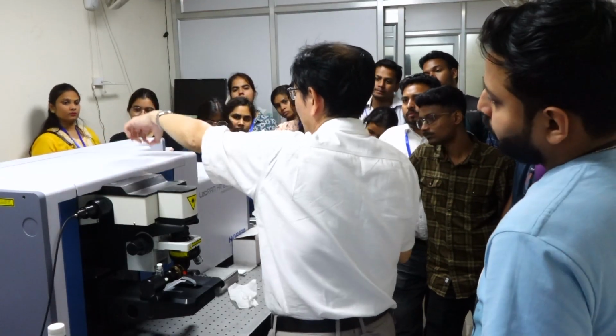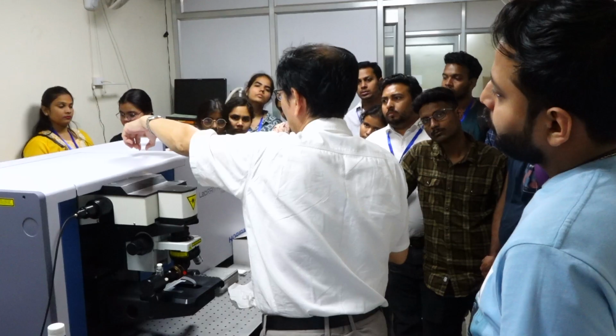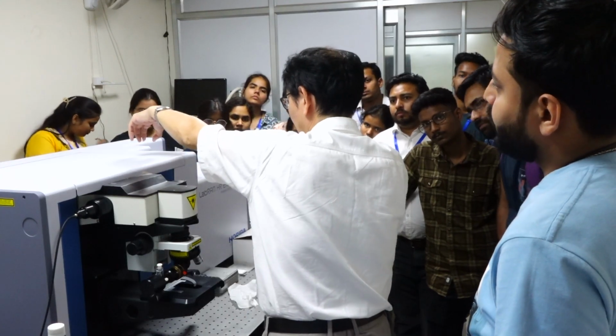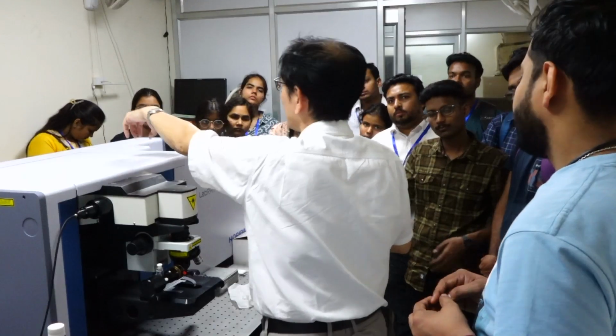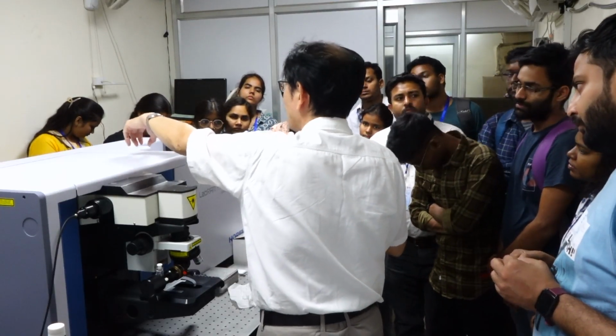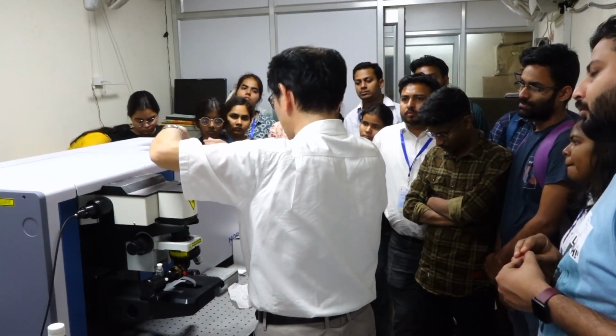I guess one more filter should be here, a notch filter, to remove the excitation wavelengths to make the efficiency higher.